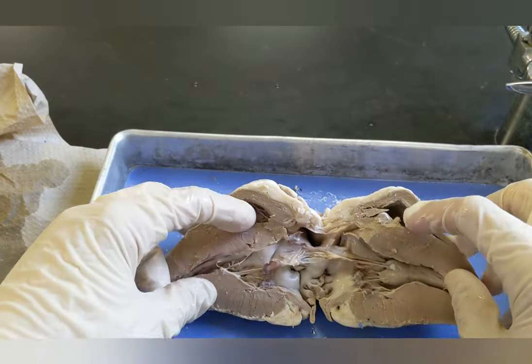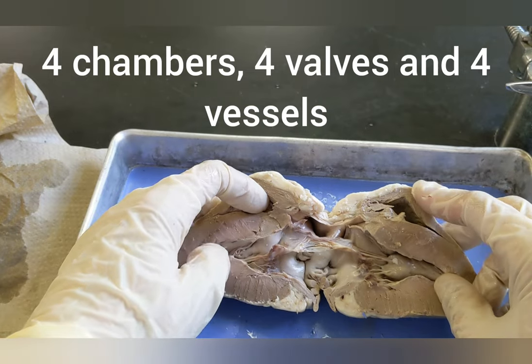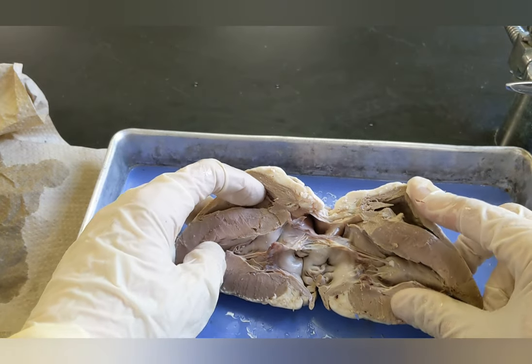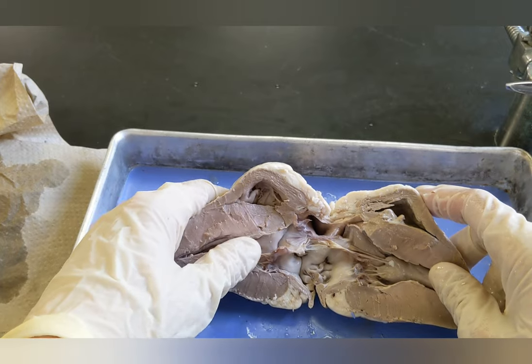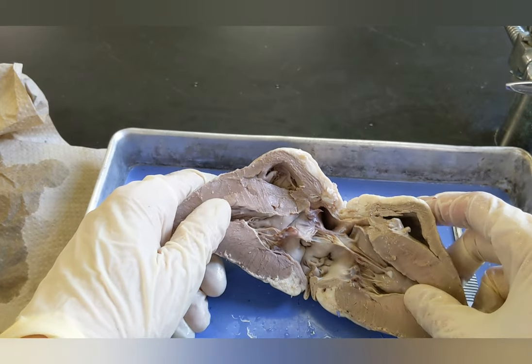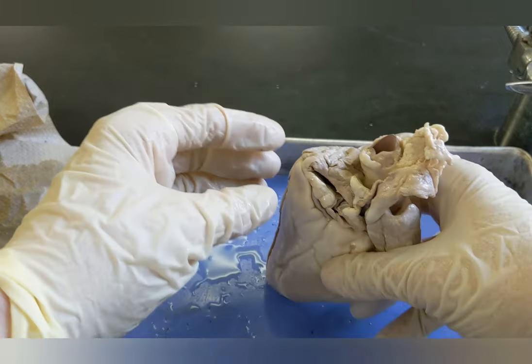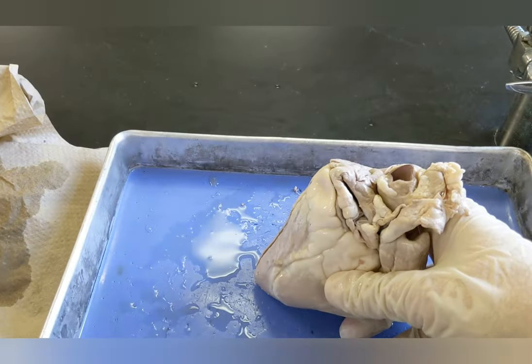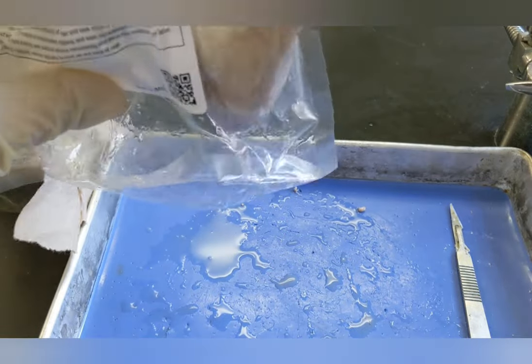So the heart has four major chambers, four major valves, and four major vessels, and we have located almost all of those things — except the semilunar valves, because you can't really see those in a dissection. When you are done with your dissection, just take the heart, put it back in the bag, and put it into the trash.